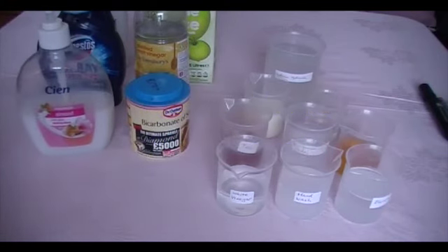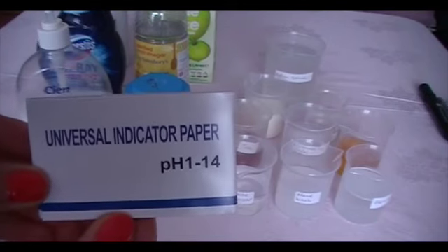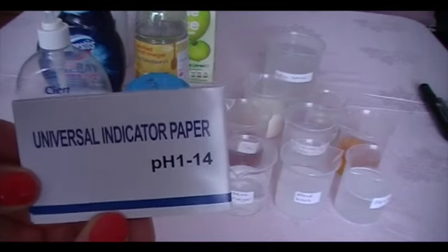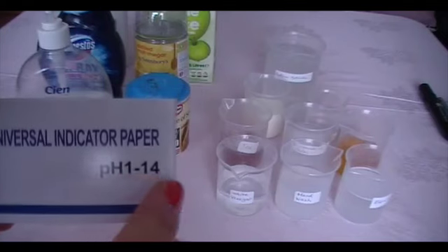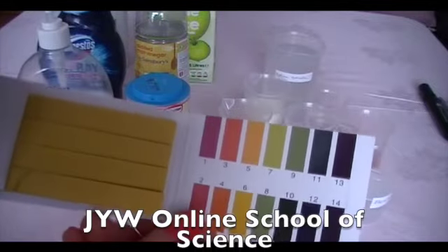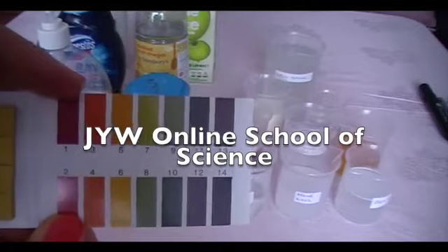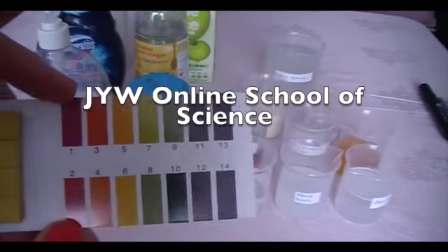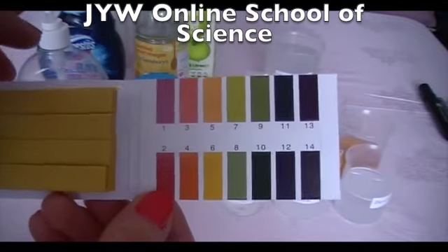Now what I use is this universal indicator paper. This paper has got a pH of 1 to 14. So if you open it up, it's got this paper, and then you have got this pH scale here. So you can see, you dip the indicator paper into the solution and see the color.